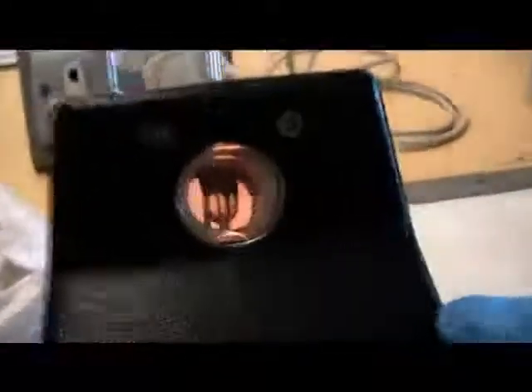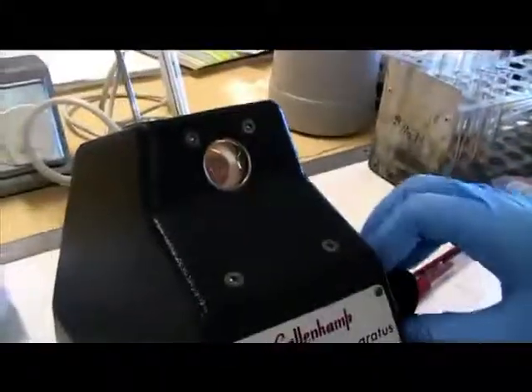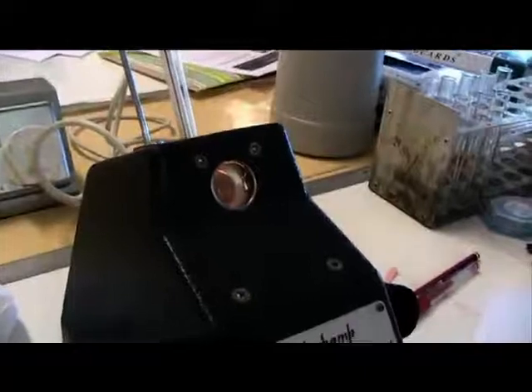So we're using the melting point apparatus to determine what our melting point is, and the melting point is when the last crystal dissolves. So then we will know our melting point. So we use the melting point apparatus, and for our first one we got 104, and for our second one we got 106 degrees Celsius. So now we're going to look it up on the table and find what our carboxylic acid is.